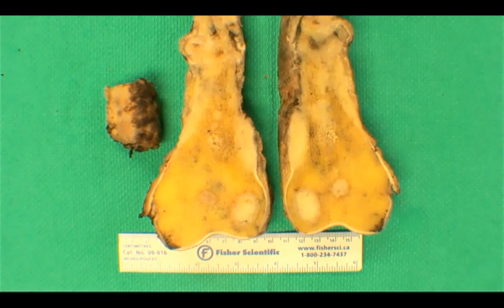Okay, in the chat, we have 2 bone specimens here, but I'm curious, what other specimens should be decaled that come through the lab? Everyone immediately thinks about bone. Yes, valves, excellent. Any other examples? Teeth, that's a good one. Bone marrow, thank you. Oh, dermoid's a good one, thank you. Yeah, I think we got most of it.